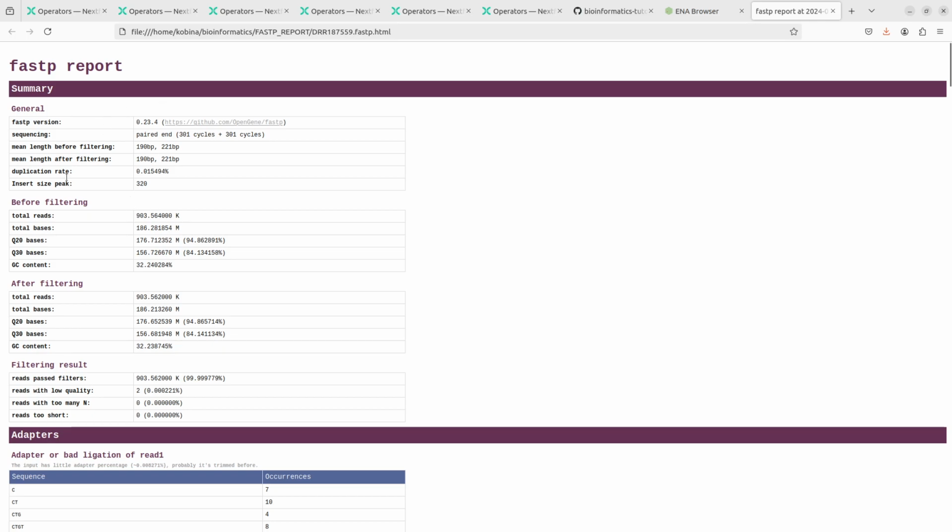Here, for the most part, we used default settings for some of the options, and so that's why we see this. You can make modifications if you know what you are doing and then compare the results you have. This is just for one sample.